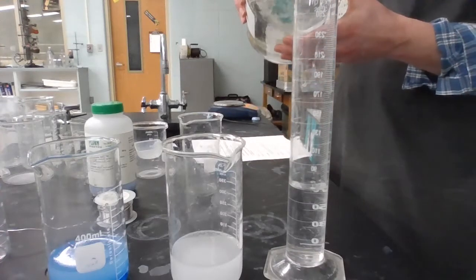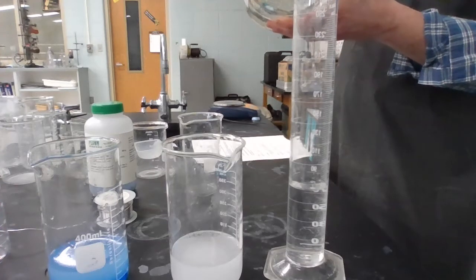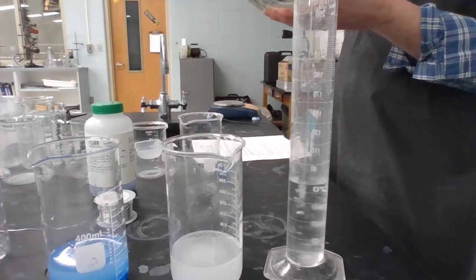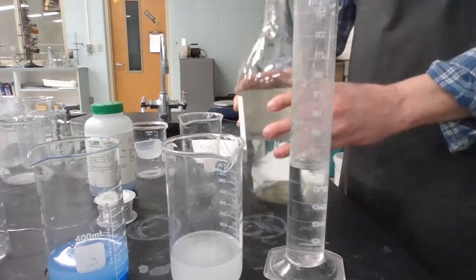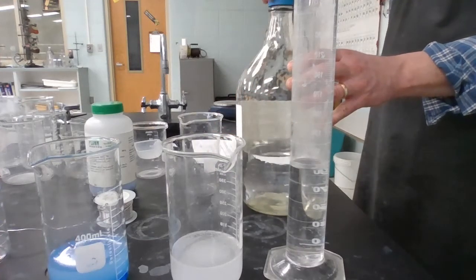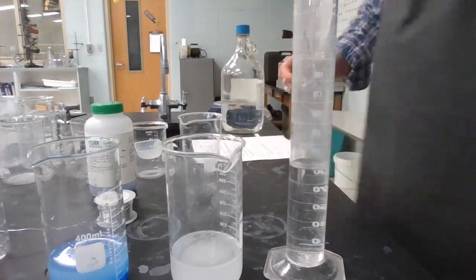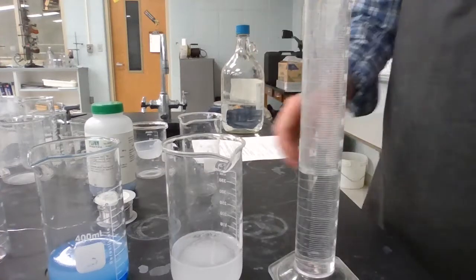And so I got to add a certain amount here. I'm going to try to add it right up to 100 milliliters. Oh yeah, that's some nasty stuff there. Okay, so we're taking it down to 1.5 molar, just a little bit more concentrated than your stomach acid. So yep, you got hydrochloric acid in your stomach. That's what we got here.